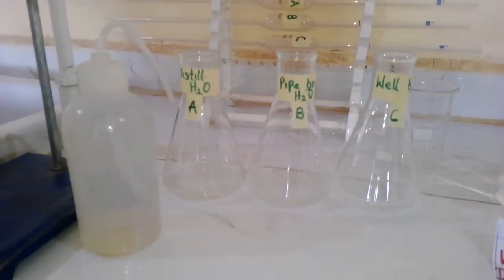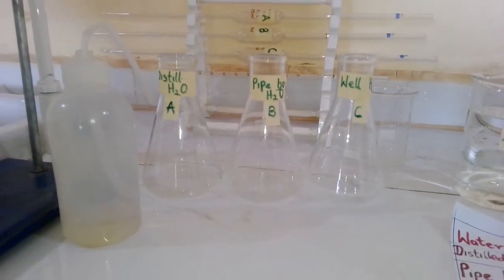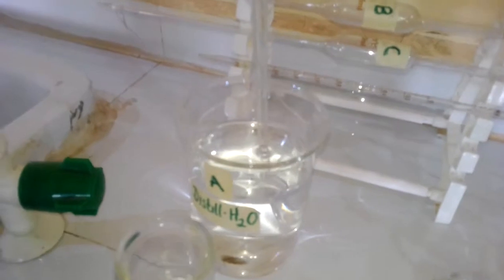Discard all the content in the 3 conical flasks and rinse with distilled water. Repeat the titration procedure once again, using all the 3 samples which have been subjected to boiling. First, we start with the distilled water.